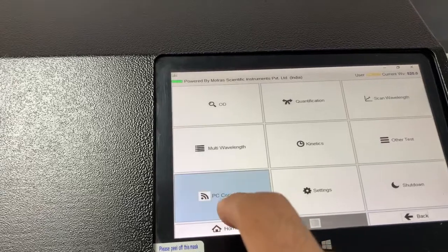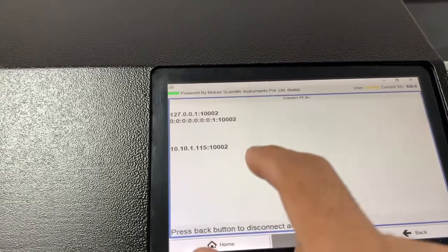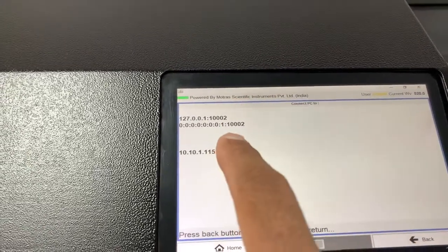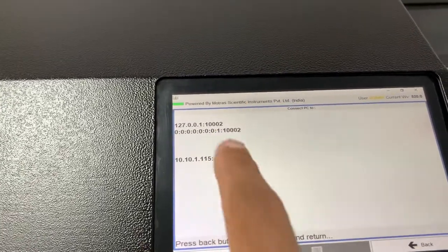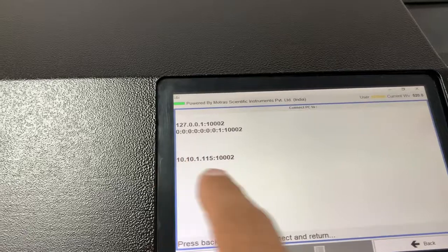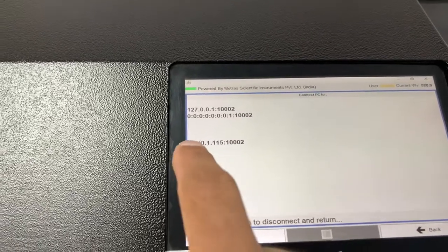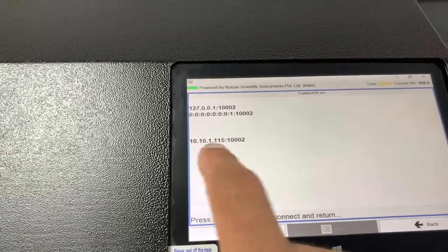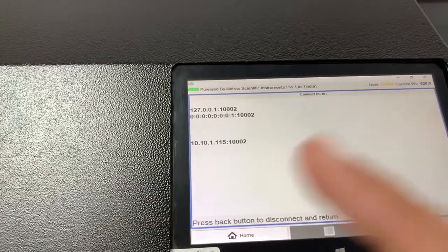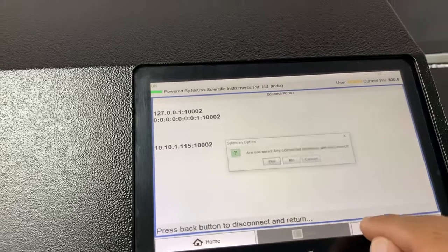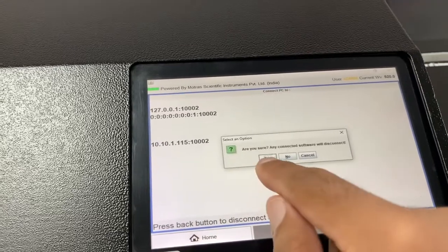Then we have PC connection. We have Wi-Fi and Ethernet — currently it's connected on Wi-Fi. The client system can put in this IP address and then do the operation remotely as well.